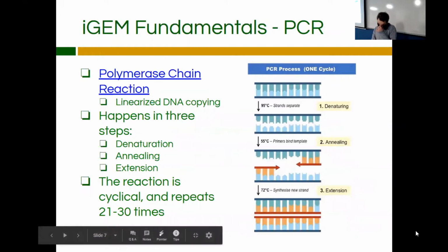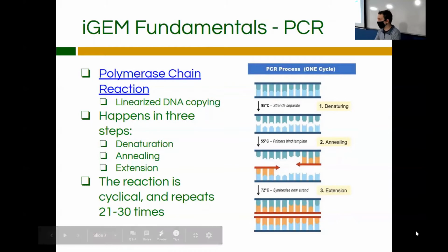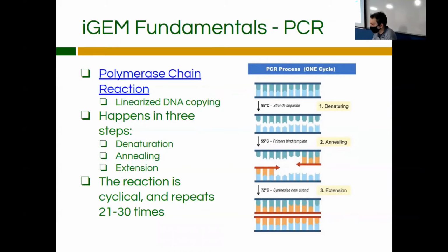Okay, so PCR is also called polymerase chain reaction. You can kind of figure out what it is based on its name. Poly means many, erase is like enzyme, chain reaction, it keeps on happening, right? And pretty much what this is, is just linearized DNA copying. Unlike using E. coli to replicate plasmids, this is strictly focused on replicating linearized DNA.